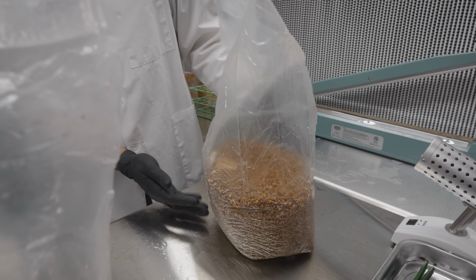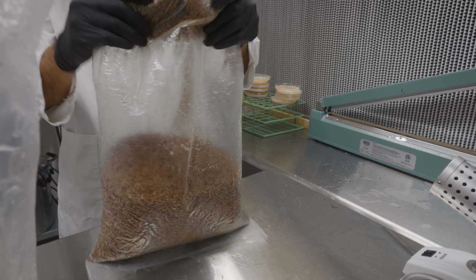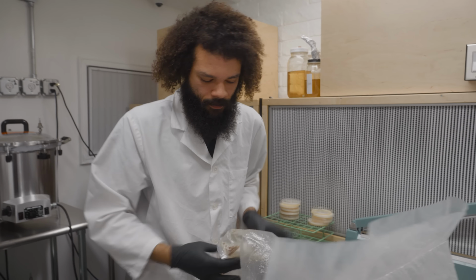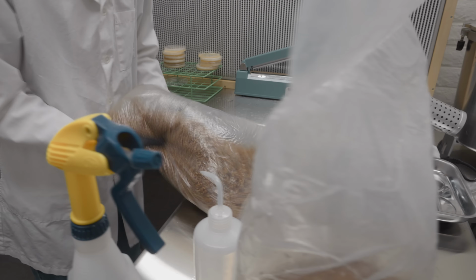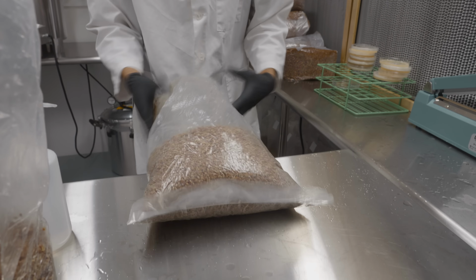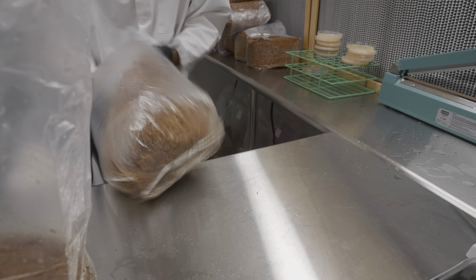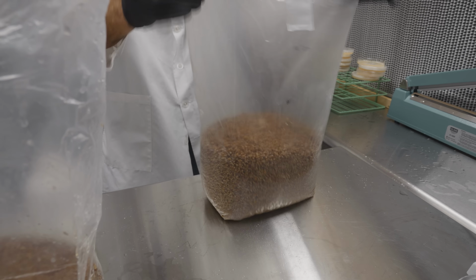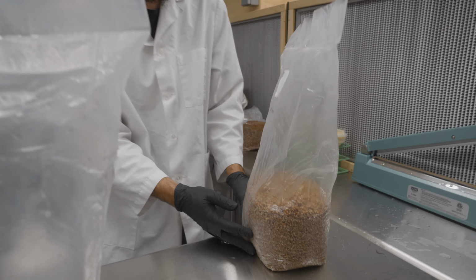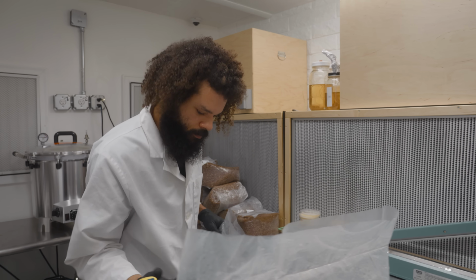Now that the wedges are in the sterile grain, we can break them up. That'll break up the mycelium, and we'll be able to spread it further throughout the grain. Now there's an increased colonization rate, and moisture gets redistributed. There we go, we have a nice inoculated bag of grain. After the lab is done, we'll place these in a section of the facility where they can incubate and colonize, and then we can monitor them and bring them back in for further transfers.